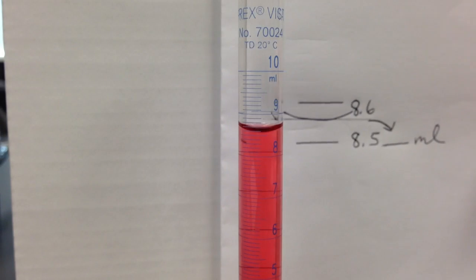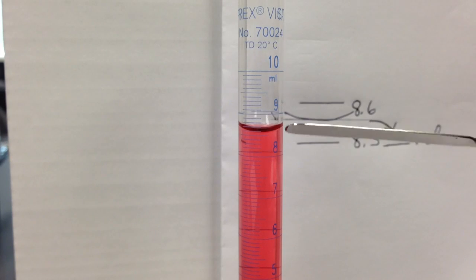How far between 8.5 and 8.6 does this measurement lie? To determine that, you want to get your eye at the level of the meniscus, which is the bottom of the curved surface.